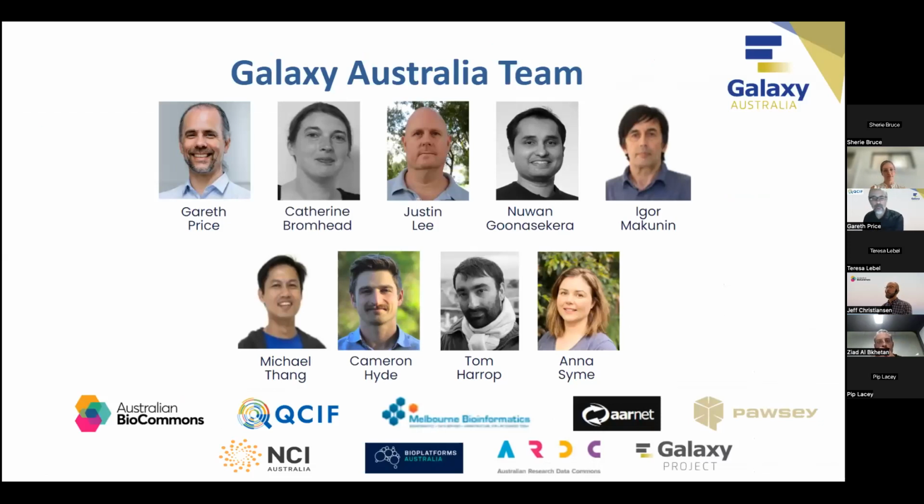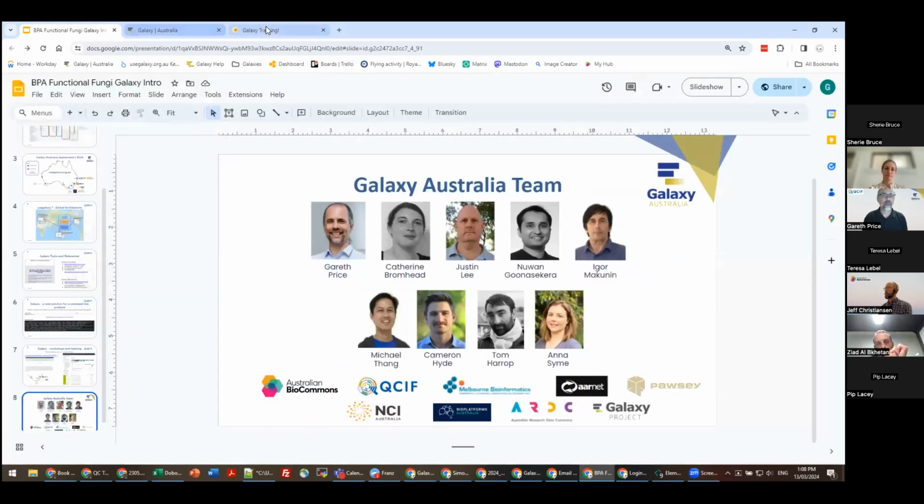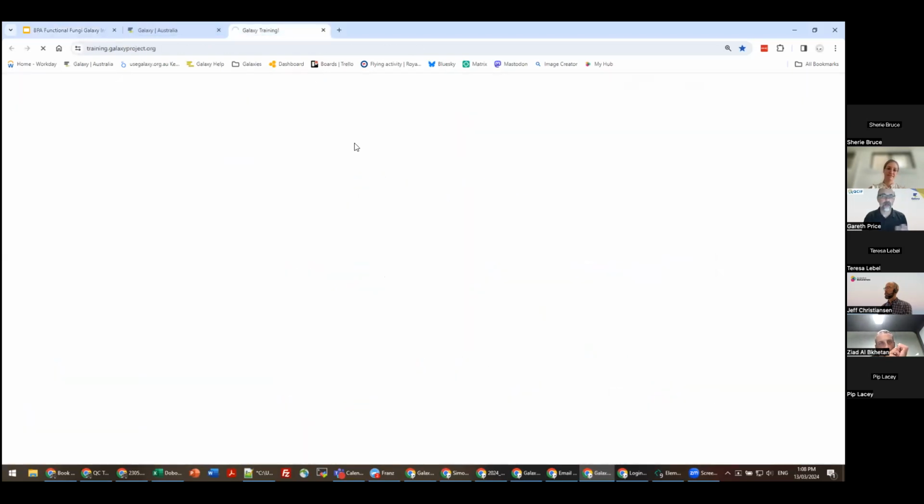And with that, I'm going to cut to a demo. I just wanted to emphasize that the Galaxy Australia team is quite a large team of infrastructure providers, support, tool developers and scientists. So you have access to all of that when you get in contact with us. I think Jeff showed enough of the training network, so I won't dive deeply into that at the moment.